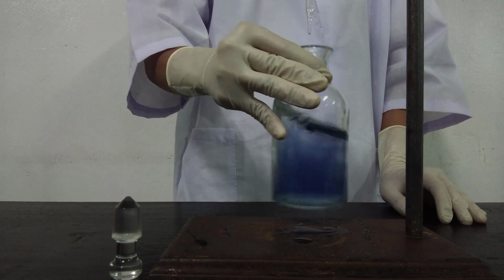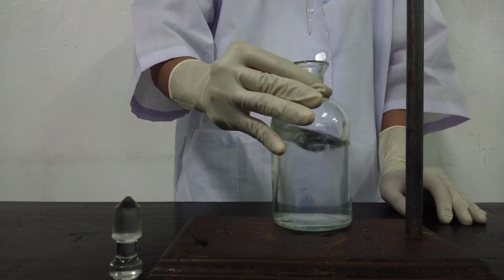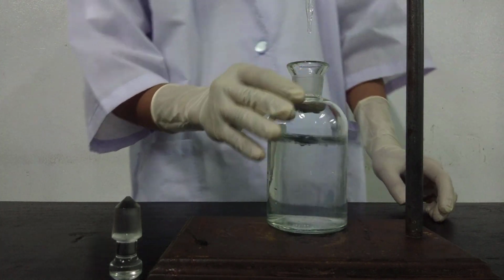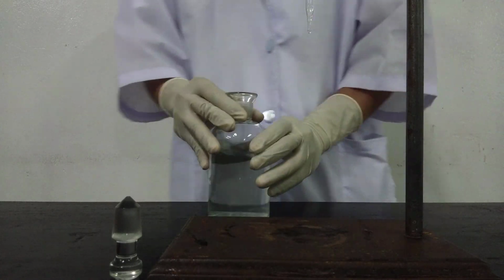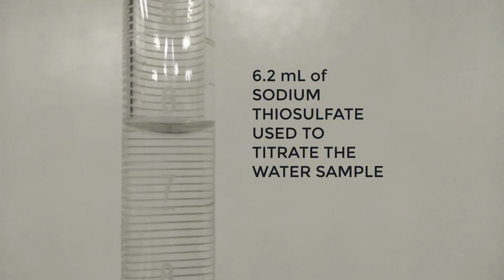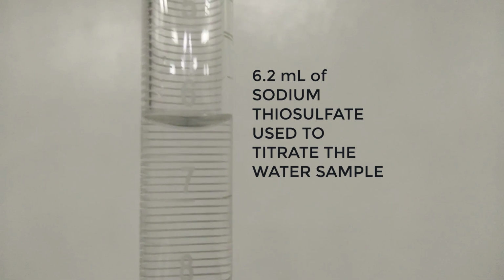It's becoming colorless already. We will stop the titration process. After this, we will look into the amount of sodium thiosulfate that was used for the titration process. And based on this experiment, there was 6.2 ml of sodium thiosulfate that was used.